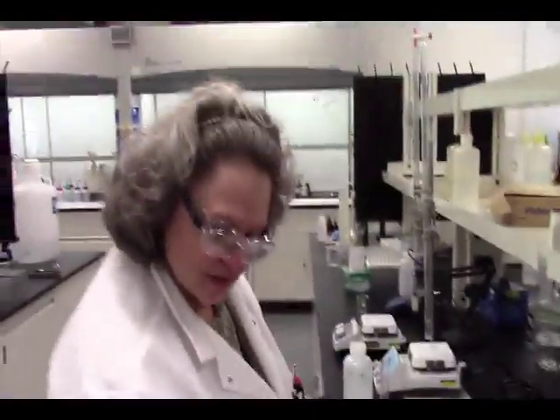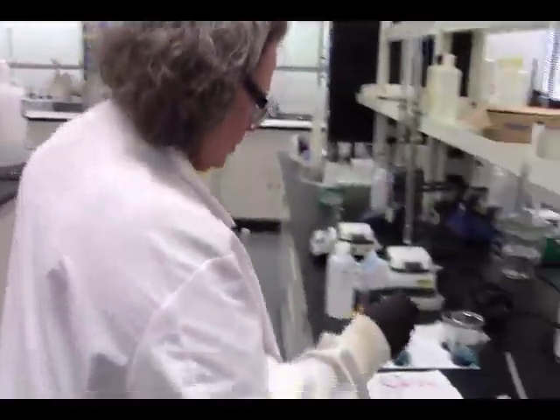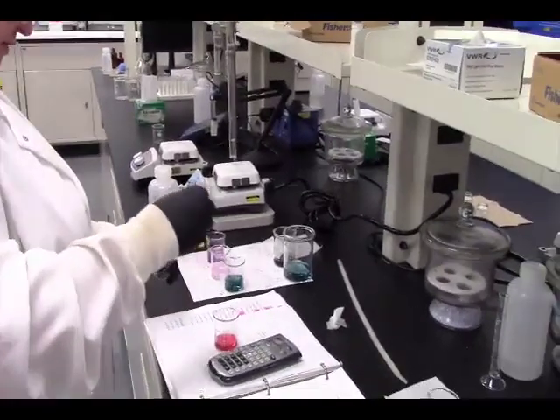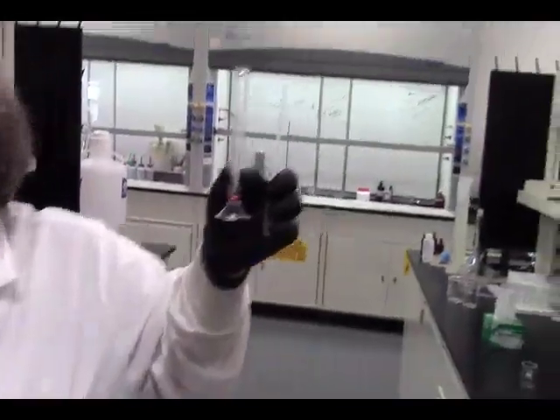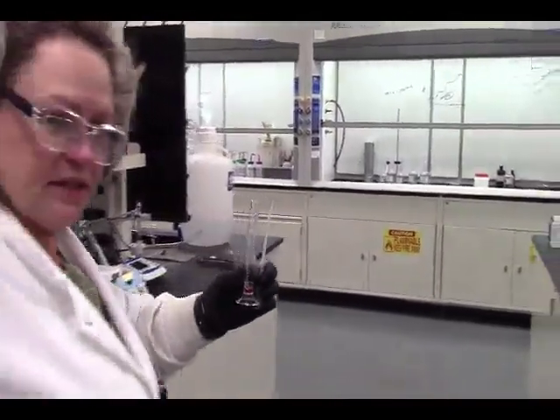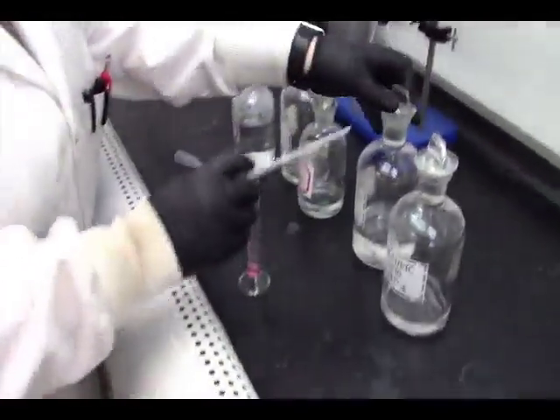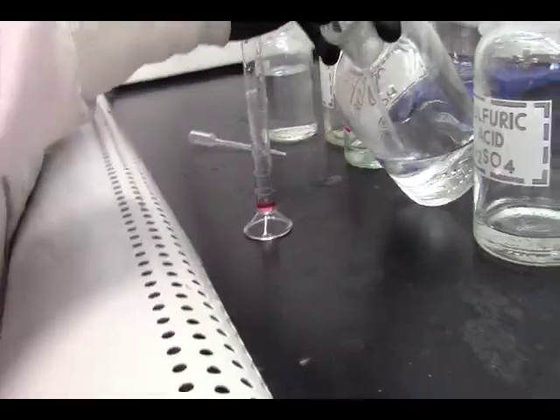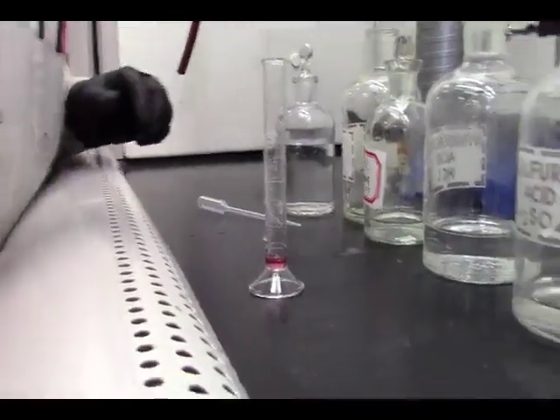I want to play with this. I want you to see what Le Chatelier's principle does when you take a little bit of this, because remember that has some water in it. So let's take a little bit of this, and you see that color. And you actually did this in general chemistry. You may remember it, you may not. We're going to take just a few drops of concentrated hydrochloric acid and watch what happens to the color.